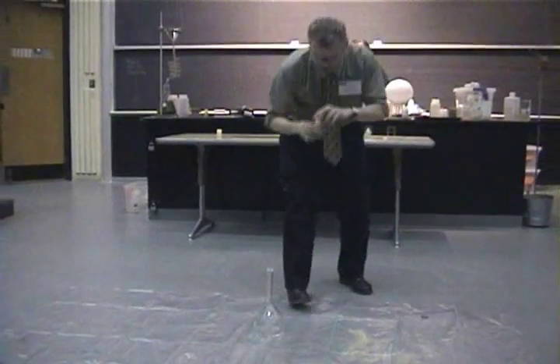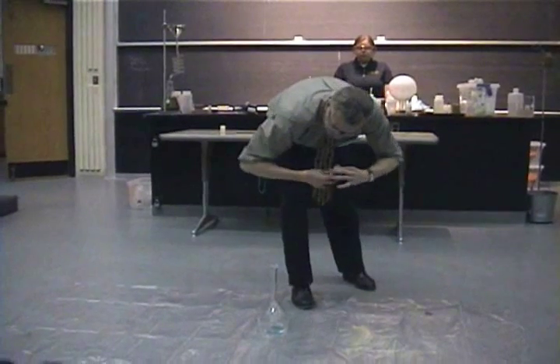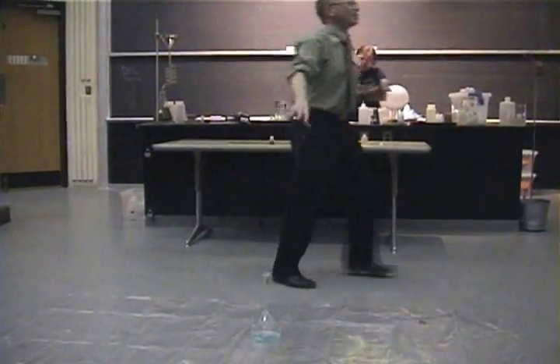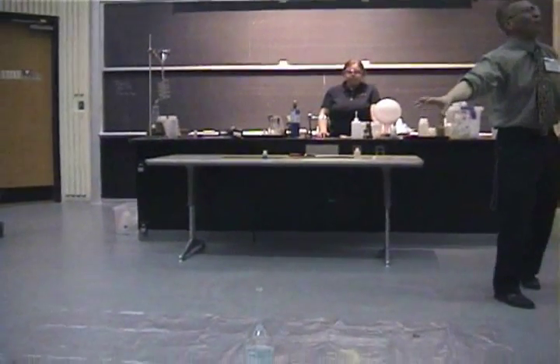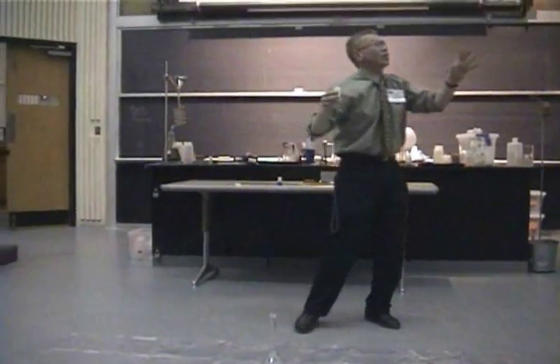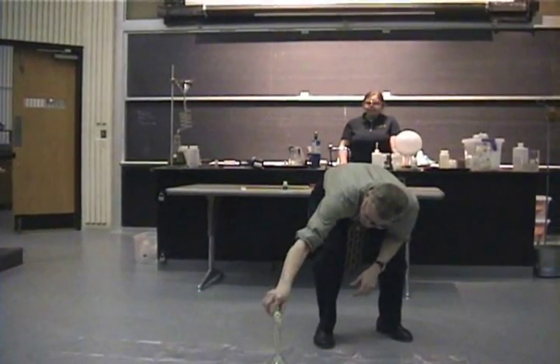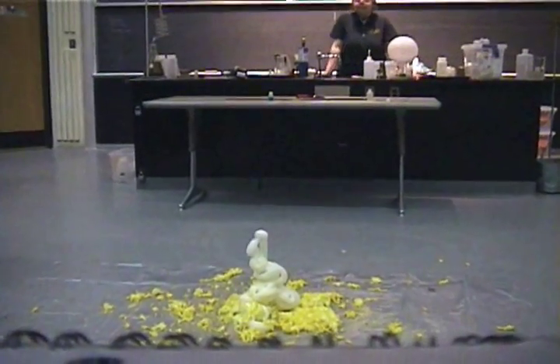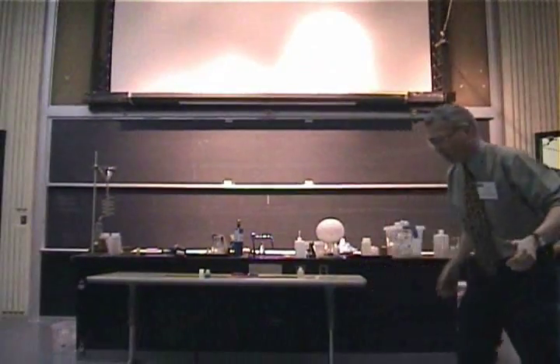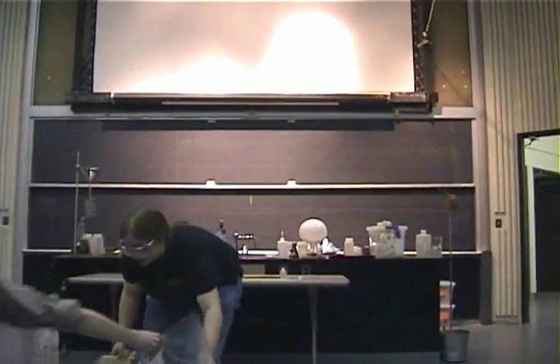I'm going to add a little bit of soap to this reaction mixture. The reason I'm adding soap is because the decomposition is going to produce oxygen gas. If I have oxygen gas produced, I'm going to end up making soap bubbles and I should be able to see foam. The decomposition takes place much more rapidly in the presence of a catalyst. We get the rapid generation of oxygen gas, which combined with the soap makes the foam, which shoots up out the top of the flask. This is the one thing that we do that makes a mess — we kept most of it in the container, but not all of it.